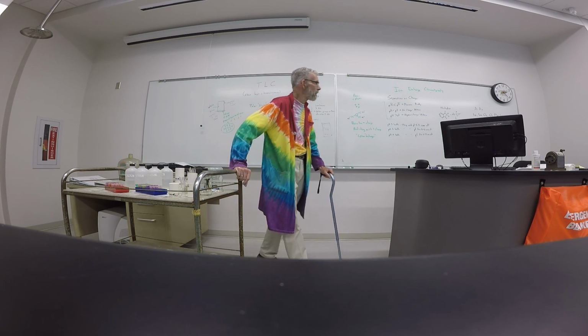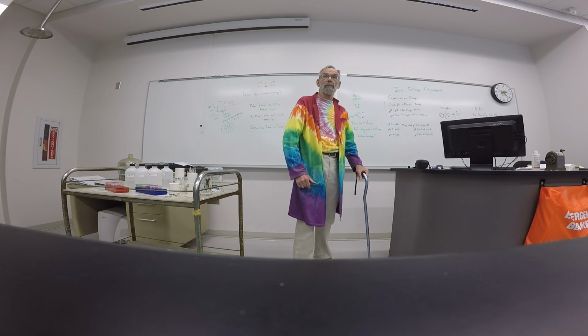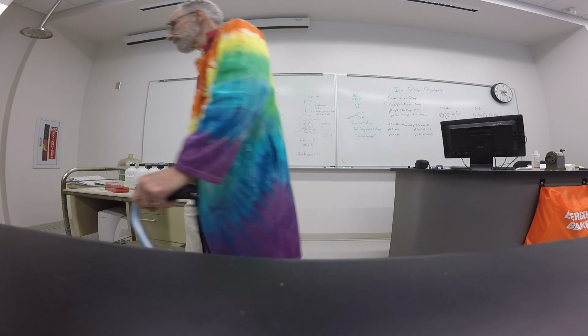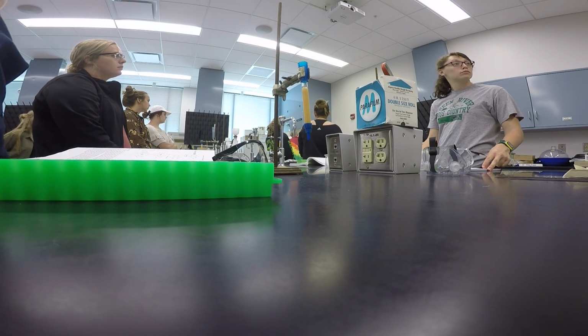Now the other thing about that ninhydrin reaction: where else would you find amines or amino acids in today's lab? On your body, on your skin. So the way you're going to do that reaction is over here in the liquid. It's a little bit stinky. The solvent it's in is an organic solvent.